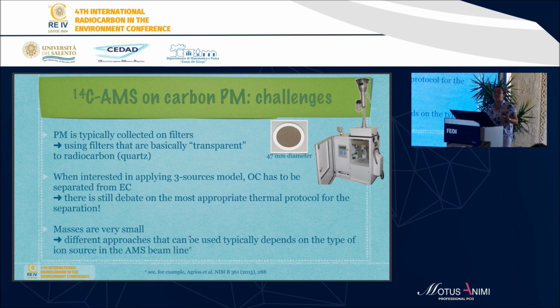And masses are very small, because if we are interested in PM10 or even in PM2.5, our quantity, our mass on the filter is not so big. And in addition, you see here a filter, okay?